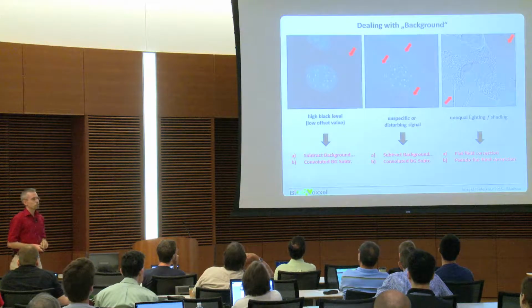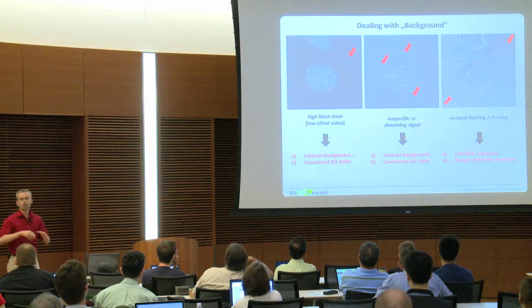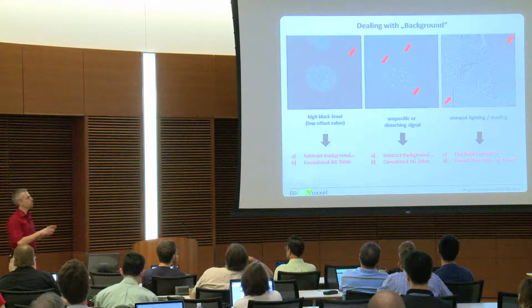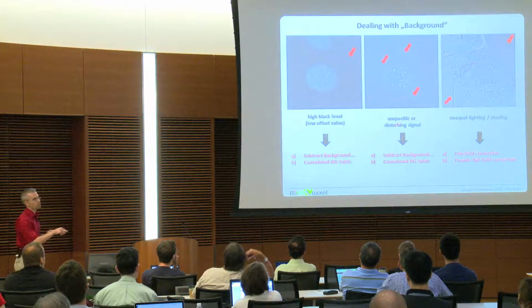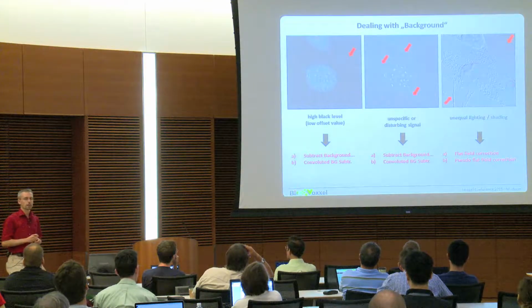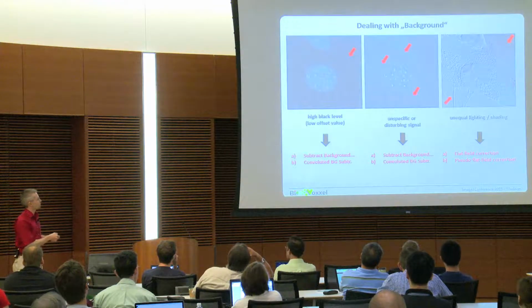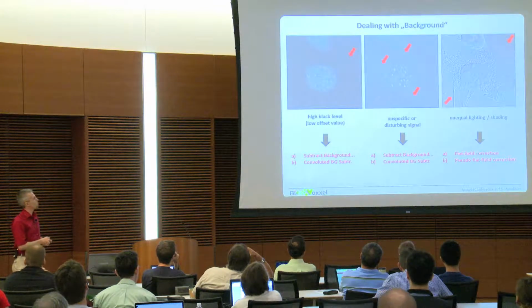The problem with that is just that this is the ideal case, and normally we do not have a very equal lighting. If you have, in addition to that, unequal lighting occurring, then that is already not working. And then functions like subtract background are very handy for that, and that is why we will also go through that.